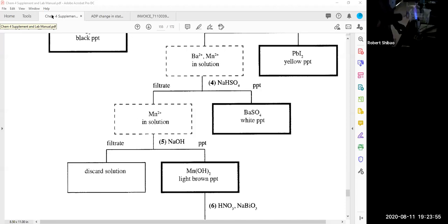Okay, when you have hot glassware like this, you always point it away from you. That way, you always grab the end that's closest to you. So if I were to grab this test tube, I'd grab it by this end. But if you have it pointed towards you, you'll grab the hot end. And hot glass looks the same as cold glass, and this is how people end up getting burned. So we let these cool down on a ceramic plate, pointing the hot end away from you.